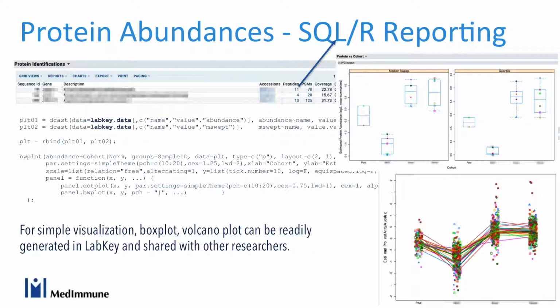So we see that, okay, my favorite protein has a change in abundance from the baseline to a different condition. People really love to see that because they have their favorite genes, favorite proteins. They can go in and see what we actually measure. And if you really want to know, you can see at the peptide level or spectrum level how the abundance changes from condition to condition. So that better be consistent with the protein information. But sometimes it's not so. So this is a great feature.